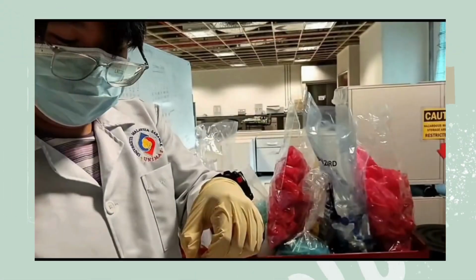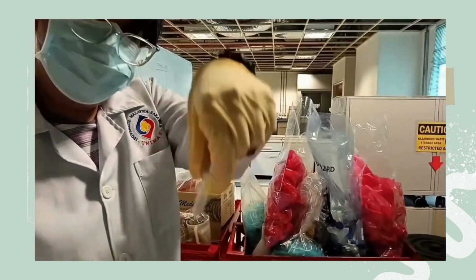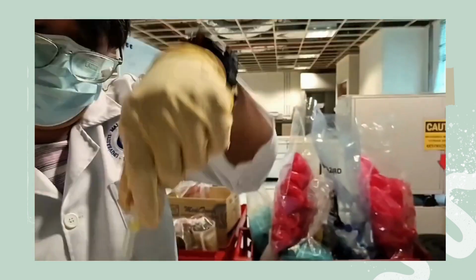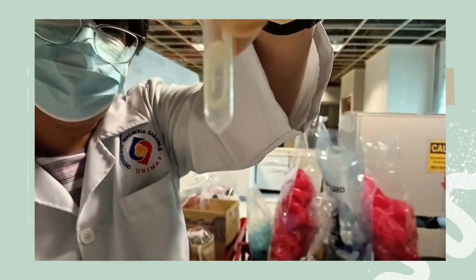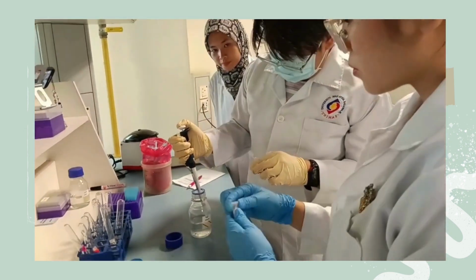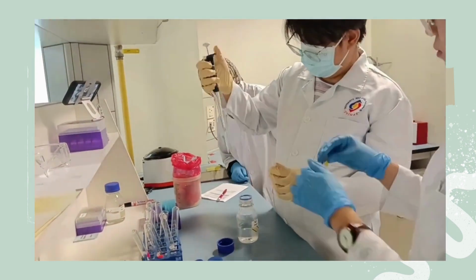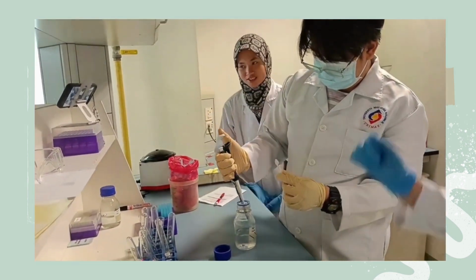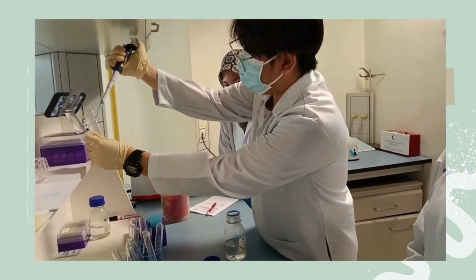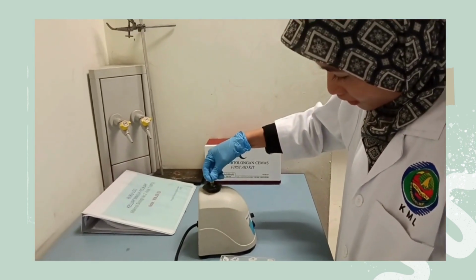Two sets of three separate microcentrifuge tubes were prepared. 5 drops or a small amount of solids were added into the microcentrifuge tubes. In the first set, solubility in polar solvent, 1 ml of distilled water was added to each centrifuge tube. The tubes were capped and shaken to mix.